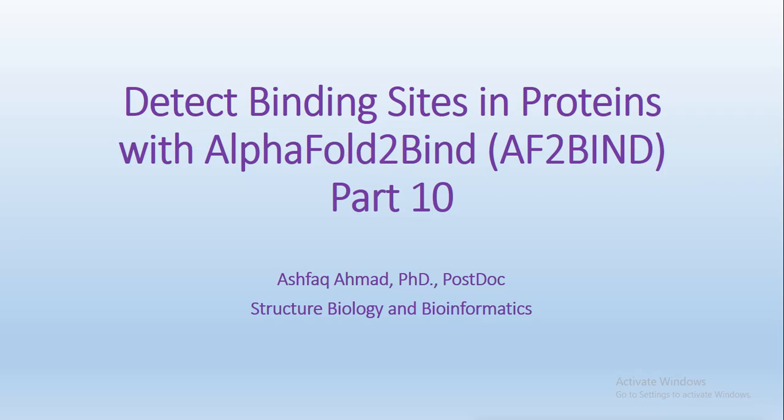The authors of this program take advantage of the contact representation of AlphaFold 2 and train a method which is called AlphaFold 2 bind. So far, the authors have claimed in their research paper, which is available, I will show you later, that this program has outperformed all the other available programs working in the field.